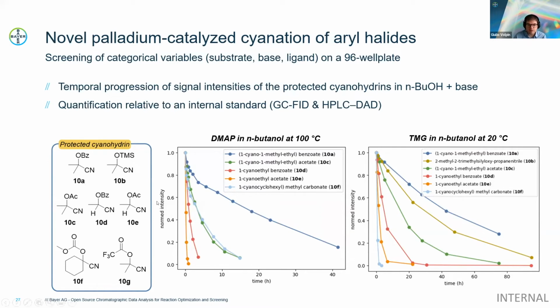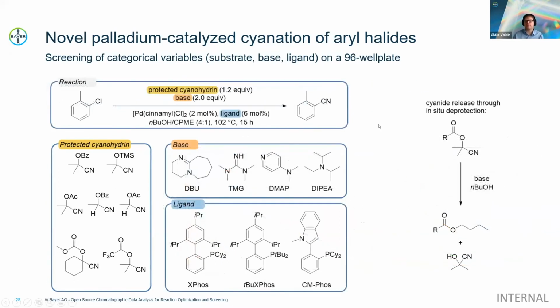And as many of you can maybe tell by the way this is plotted, this is also done and plotted with MOCCA and then plotted through Jupyter Lab. And so by having our cyanide sources in hand and a general idea of what type of plate we wanted to run, we set out to run this reaction.